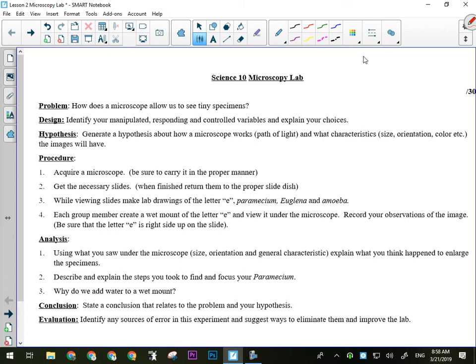And a euglena is another protist. It's a small or single-celled organism. It's quite a bit smaller than the other things we're looking at. So we want to look at it last so that we've kind of gained some experience with viewing things. I'll show you kind of what they look like here. So each time we look through the microscope, we're going to be looking at something different. And the reason is, we kind of need to see if the microscope affects everything the same way. We need to know if how a microscope works applies to everything, including the letter E.